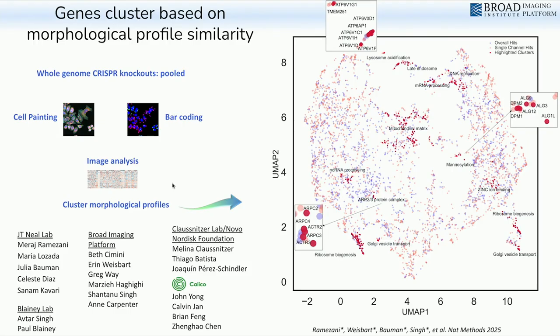And of course, you can check the paper for all the neat things we did with this data, but this just gives you a little bit of a visual view on the genes whose CRISPR did have a phenotype, of course a subset of the whole, and as we can see, they group very nicely based on their gene function. Now, this experiment was a bit underpowered.